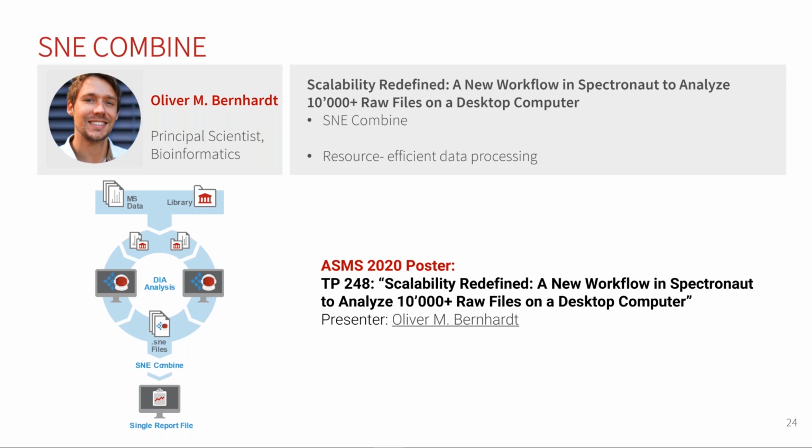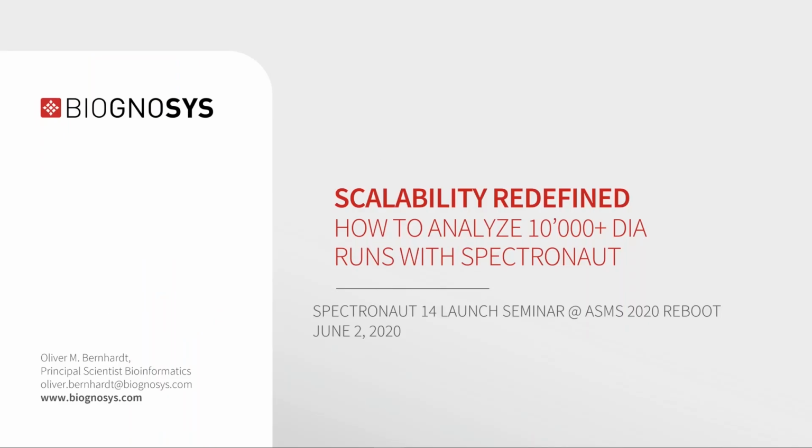Yeah, as Max already alluded in his overview slide, the topic of my talk today is something I was working on for the Spectronaut 14 release, and the title of my talk is Scalability Redefined: How to Analyze 10,000 plus DIA runs with Spectronaut.